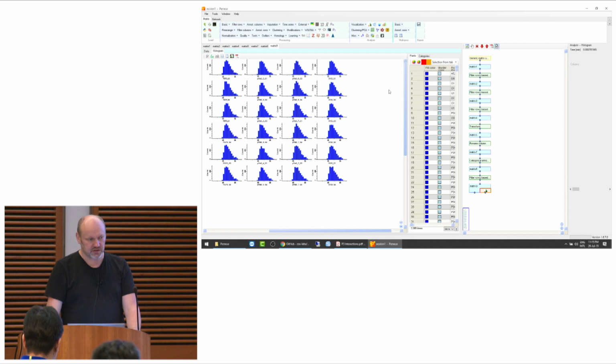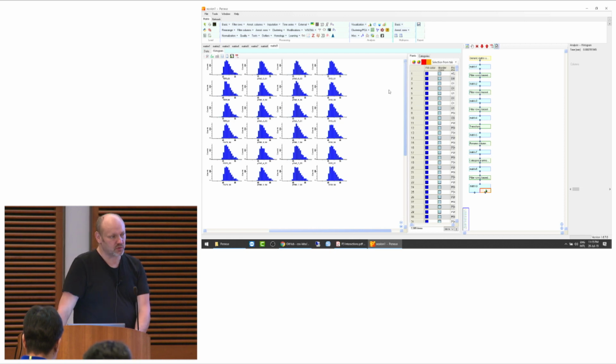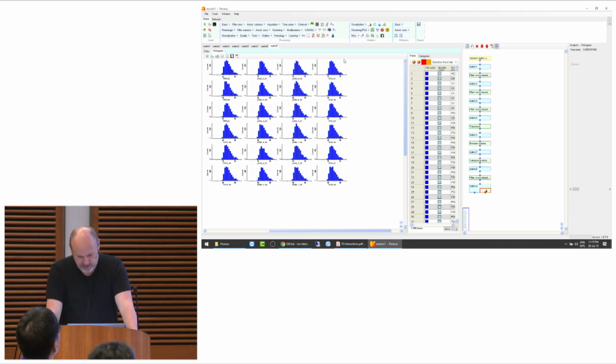So then we could just go ahead, and so the next step would be to impute. So there's still missing values in there, right? Because the filter was require good measurements in at least one group, which means there's still missing values left. And these missing values we do want to impute now, so that they actually are used basically in the t-test that we're doing on these, right? So then let's impute. So that's here, imputation somewhere.